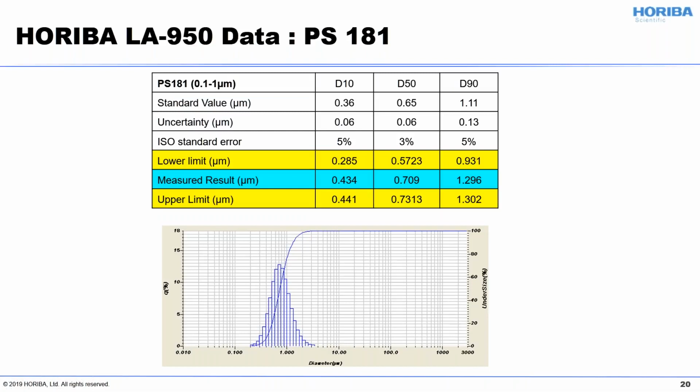Yeah, so this table isn't too interesting. I guess the real takeaway is to remind you, think about surfactants. You're allowed to use them. You don't want to pick a surfactant that's so large it significantly affects particle size, but I can't think of anything that's going to bother even this 360 nanometer particle.